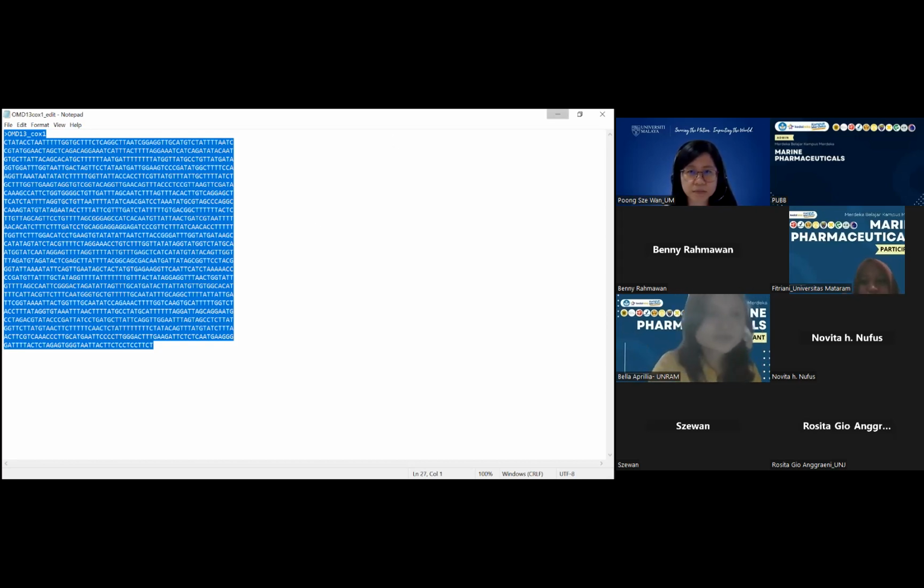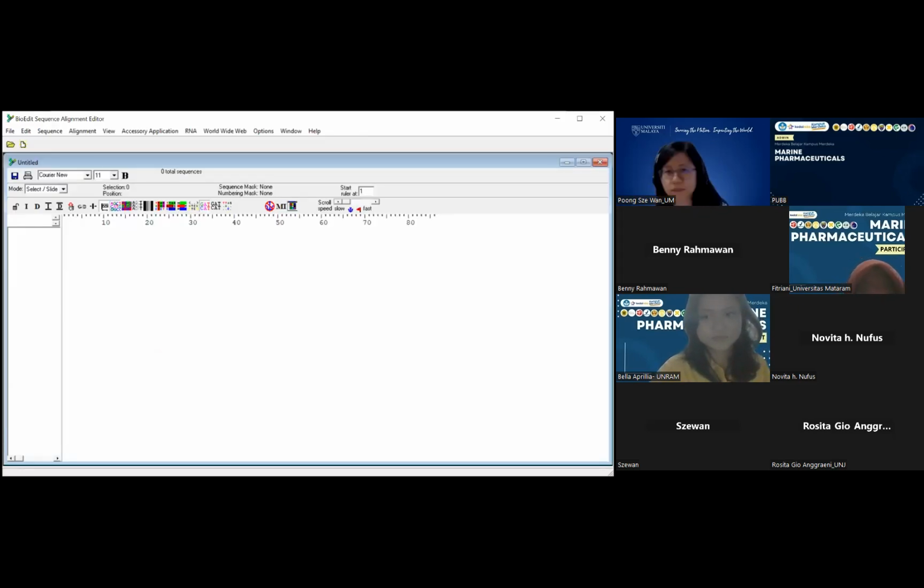and then open my BioEdit. Okay, so let me close this. So open your BioEdit software or your program. Click New Alignment. All right. Oh, are you not seeing this? Hold on. How come it's not showing? Oh. Okay, so you see the BioEdit right now, right?